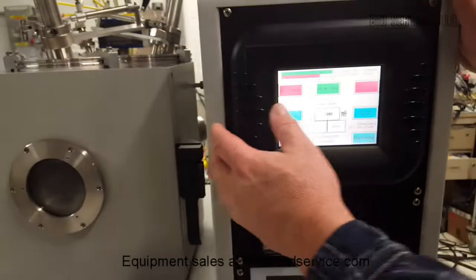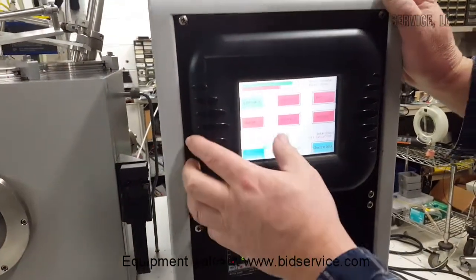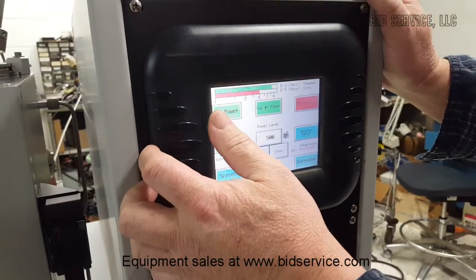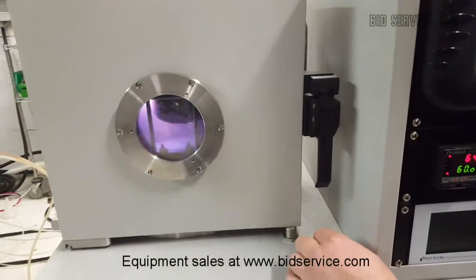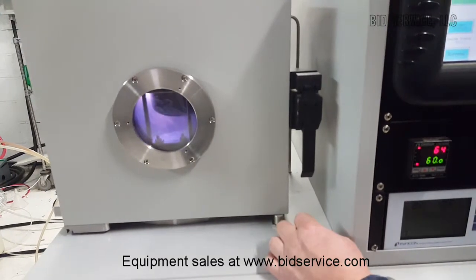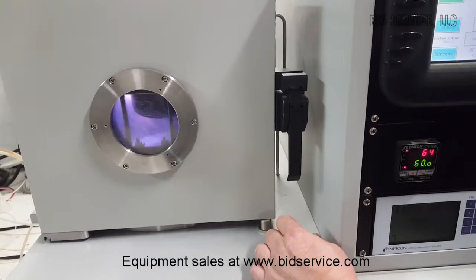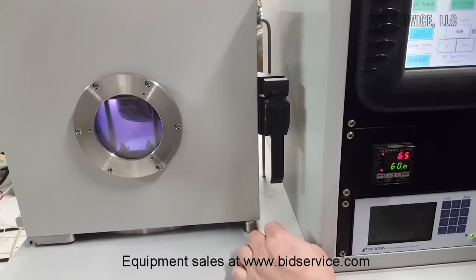Now I'm going to come over and we're going to sputter on cathode one — I'm going to turn it on. If you look inside the chamber, you can see the sputter. What we're using for targets is just a cut piece of aluminum sheet, so it's not the best material, but it will smooth out at the right pressure.